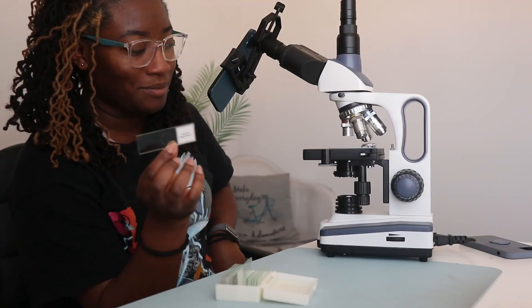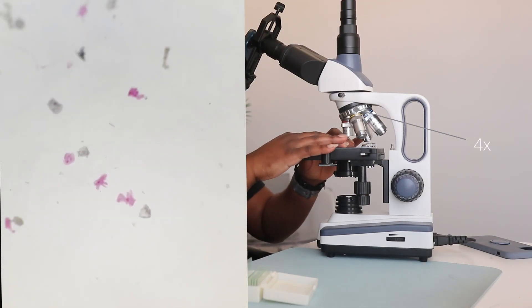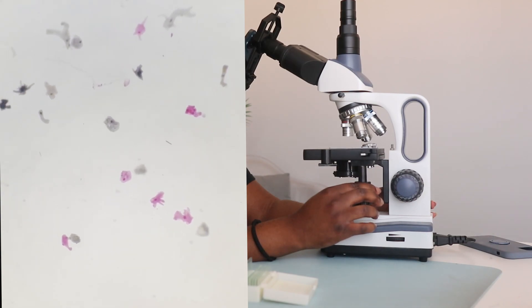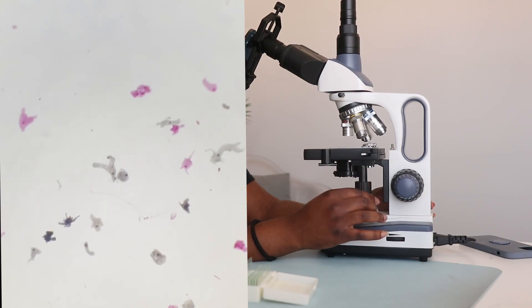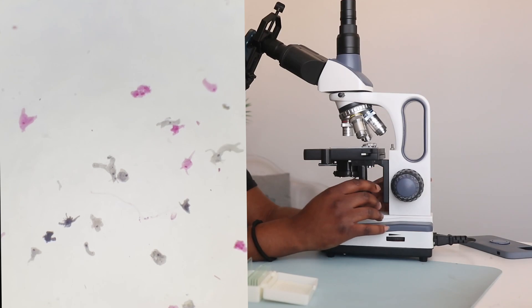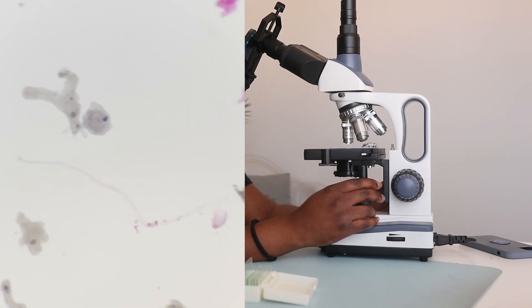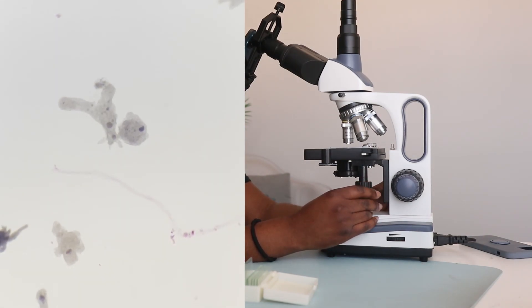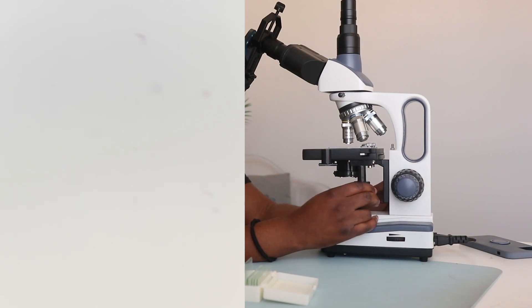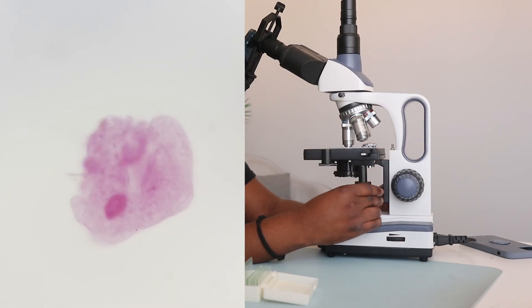Our first slide is an amoeba and I'm on the lowest objective. This is what they look like. The stuff I'm going to be looking at is too small to be using a 4x lens, but you can kind of see the amoeba there. Moving to 10x, you can see them as well. My phone probably won't be as clear as your actual eyes, but it's just cool that you can see what I see. Here's 40x — that's the amoeba.